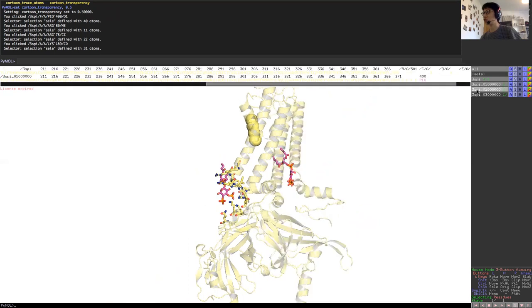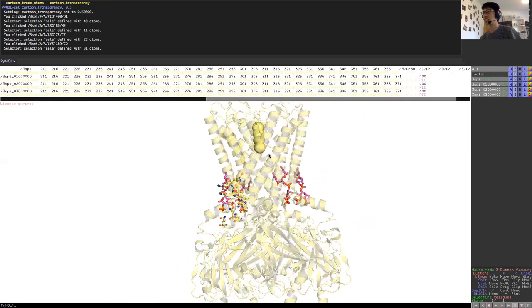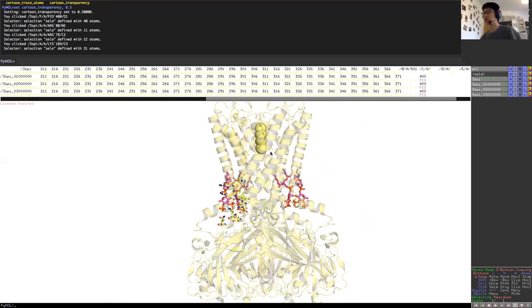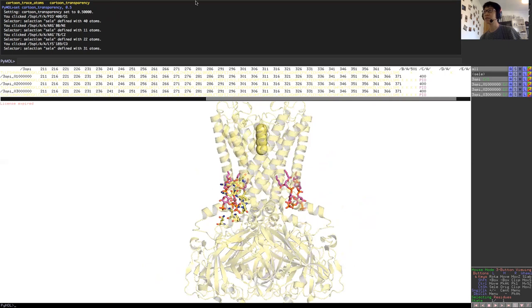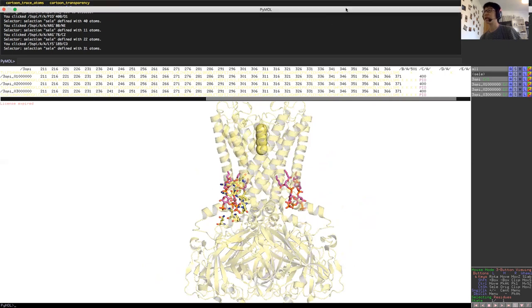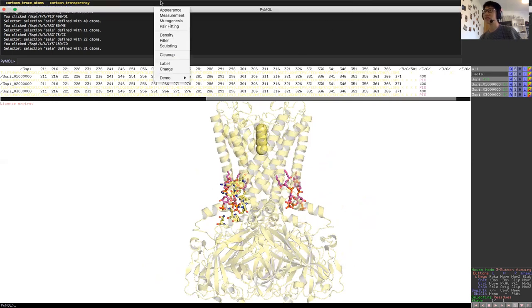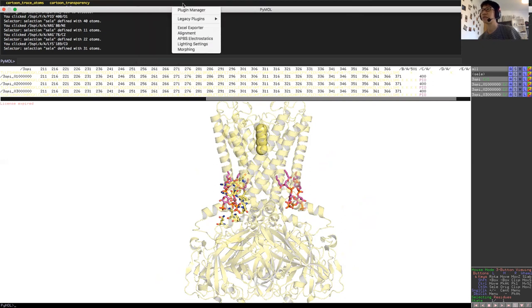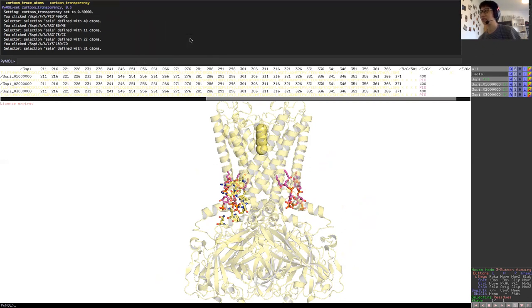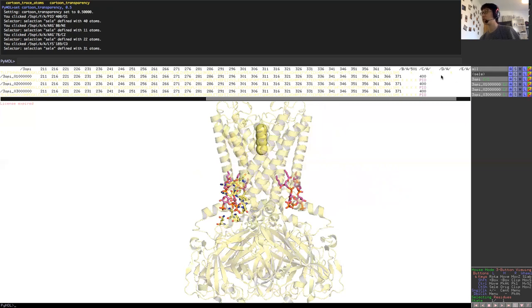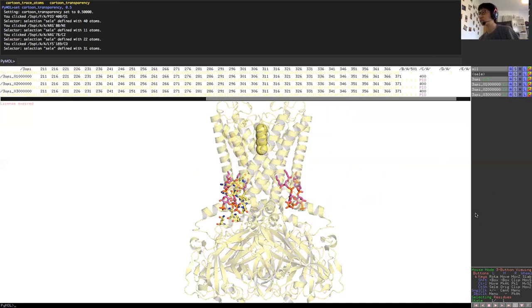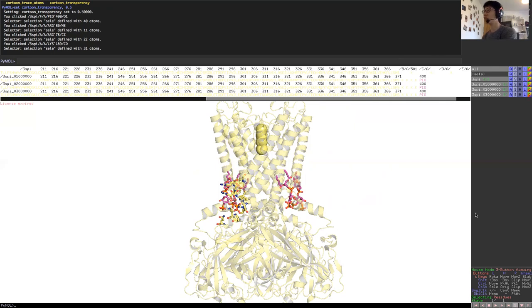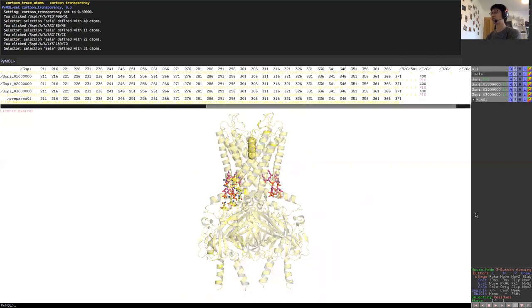If I show the whole channel molecule again, I'm going to go for plugin, APBS electrostatics. This will show us the mode that you can look at electrostatics and it has a code for it. What you can click is run. It will take a bit of time, but what it will do is that it will give you an electrostatic surface around this KIR 2.2 channel.